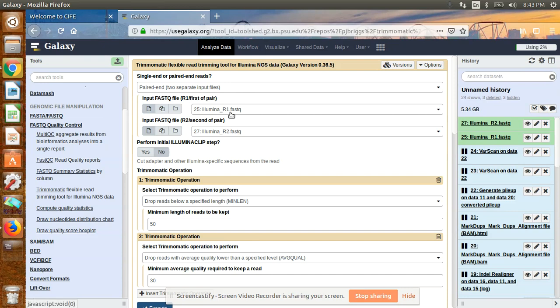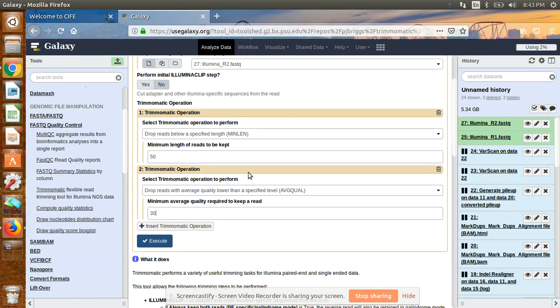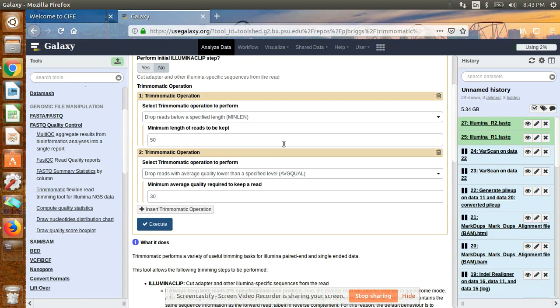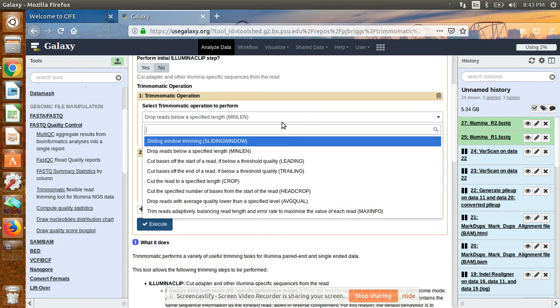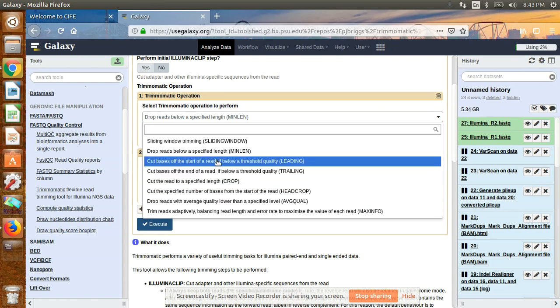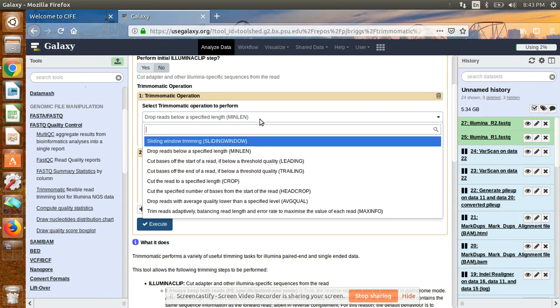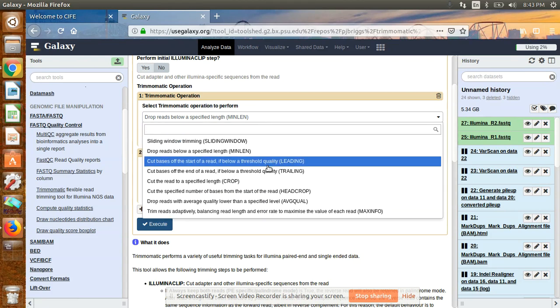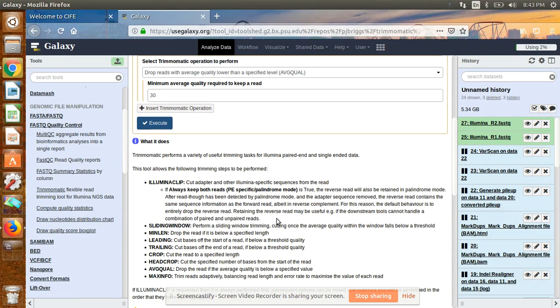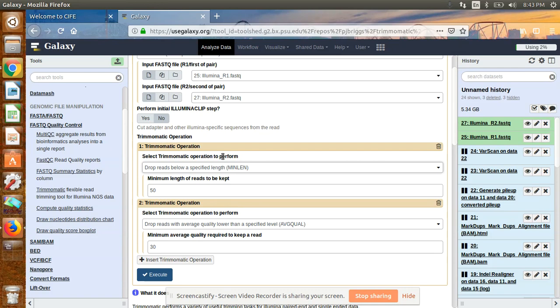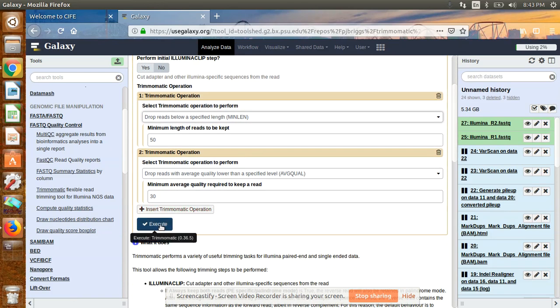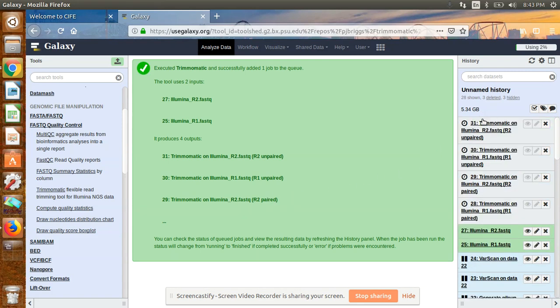Remember that the operations are selected based on your needs — you can also change or add different parameters. For example, you can cut out some bases from the start because the beginning of a sequence may have poor quality. You can also set the Phred score there. After setting all parameters, click Execute. You can see the progress of the program in the right-side corner. It is now running; speed depends on your internet connection.